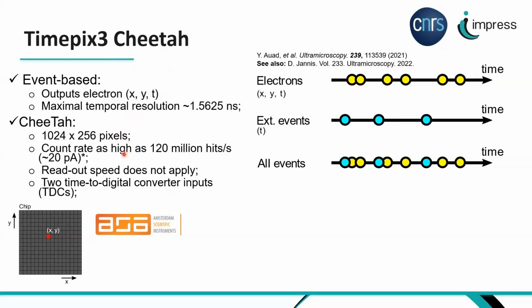As I said, the big limitation for this detector is actually the detection rate. So if you could spread out your dose throughout the detector, you can detect in each chip about 20 picoamps. But in reality, because the dose is never completely spread out, we usually work with currents between a picoamp and at maximum 10 picoamps. So that's a big limitation for this detector.